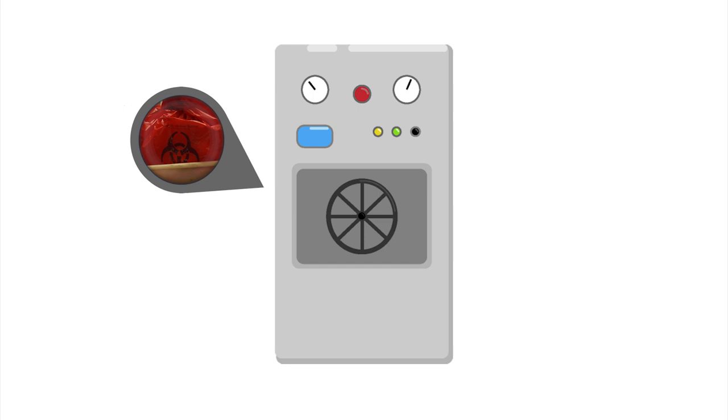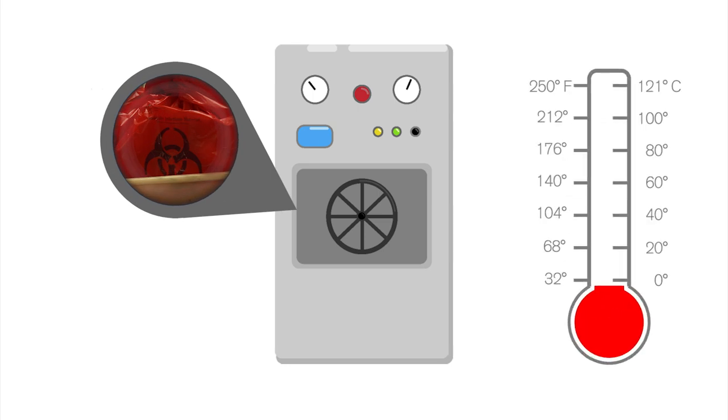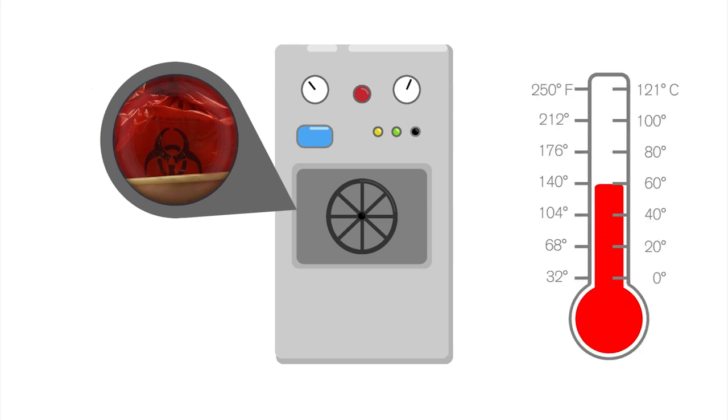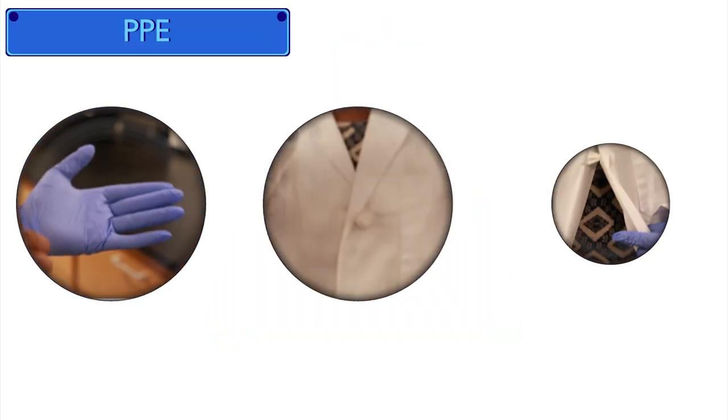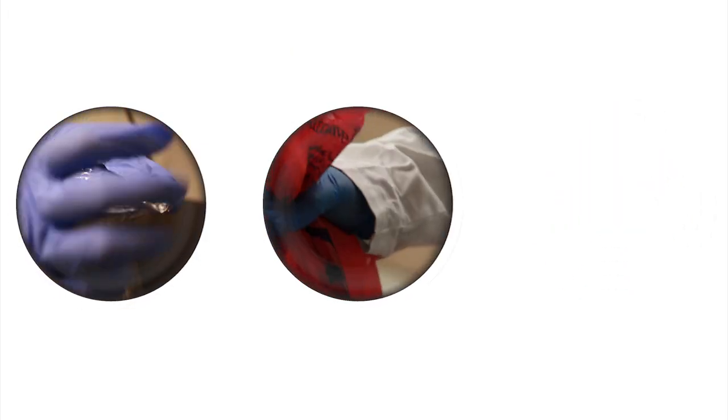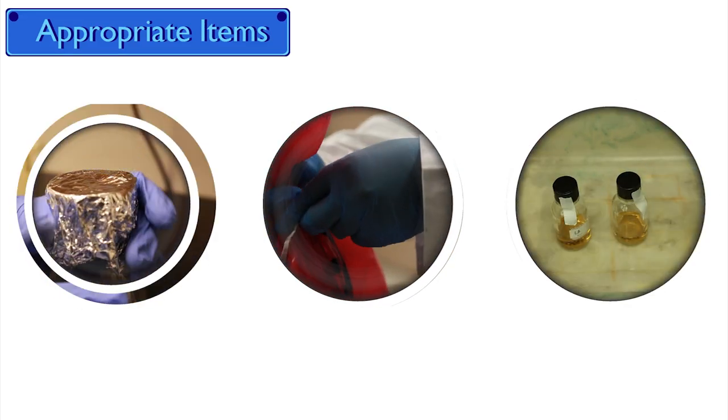When items are autoclaved, things are going to get really hot, to almost 250 degrees Fahrenheit, and become highly pressurized, causing safety hazards. You need to make sure you know how to properly use the autoclave. This includes knowing what personal protective equipment you need to wear, and to determine which items can be autoclaved, and how to do it right.